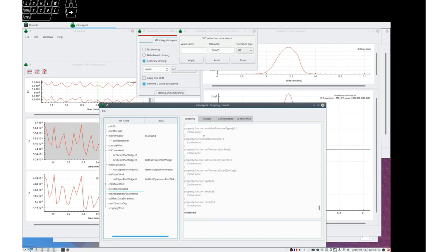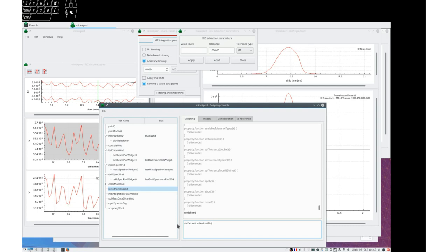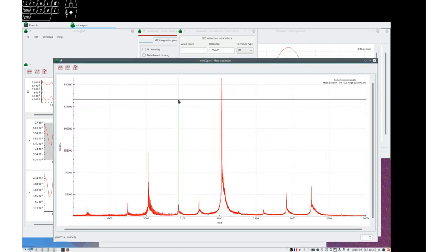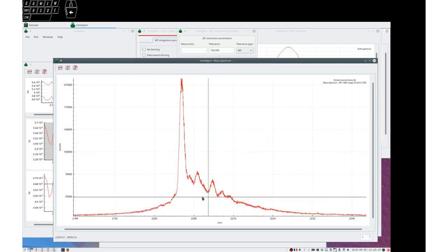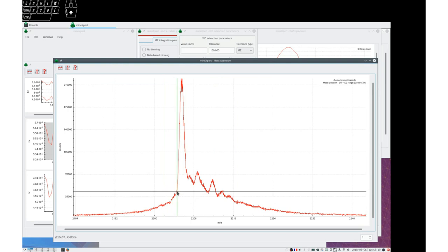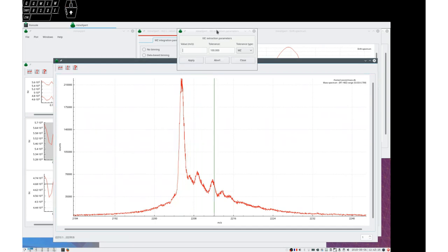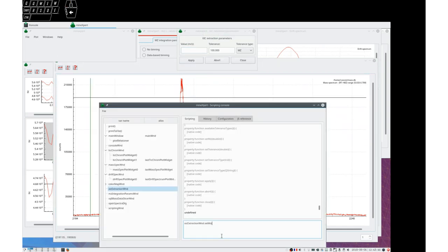For example, set MZ takes a double value here. So we could say Zick extraction window set MZ. I would like to extract, let's see, for example, from 2204 to 2206.